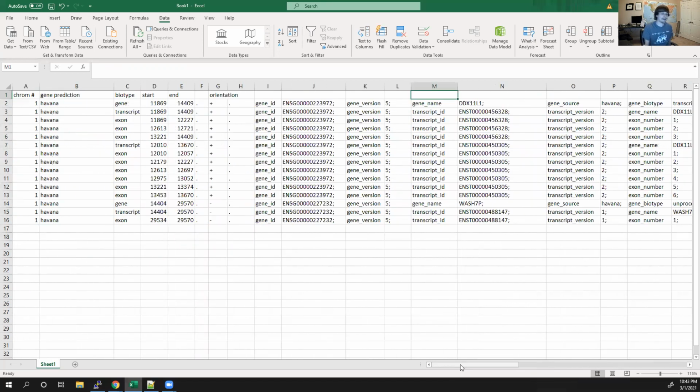And so in this GTF file, we can see pretty much anything that exists that's not an intron, that's not a TE, be annotated. So protein coding genes are annotated. Pseudogenes are annotated. tRNA loci are annotated. Our ribosomal RNA is annotated, right? All of this stuff, even the non-protein coding stuff, will be annotated in a GTF. It's just finding that will probably take a little bit of time to do.